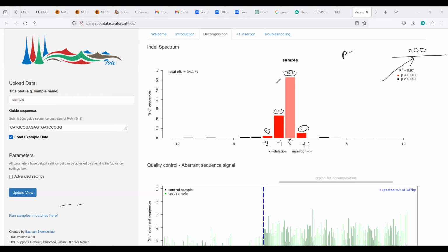Okay. So now you have a mixed pool of cells after editing. Some got edited, these red ones, and this one, the 60% one, is not edited. So you have a mixture of cells which are edited, and whatever chromatogram you get will have signals from all these things, right? So you need to delineate and find out the respective frequencies. How much is unedited? How much is edited?